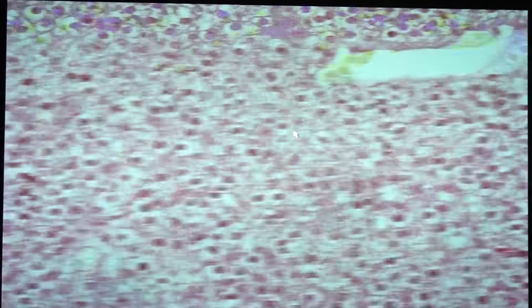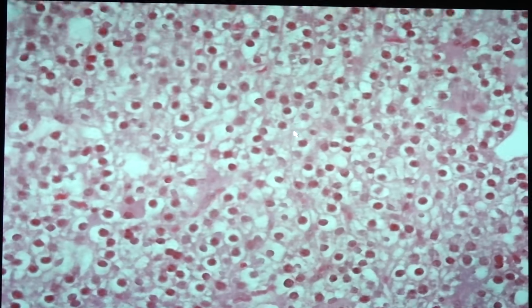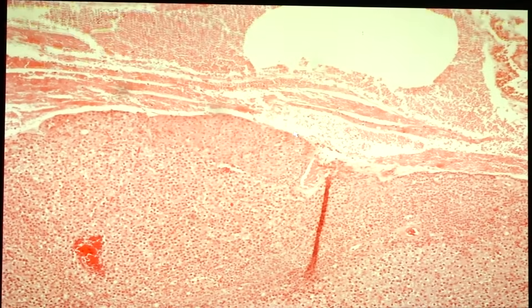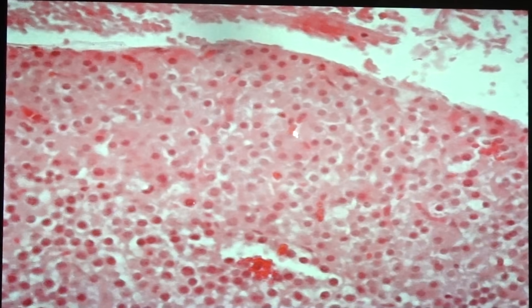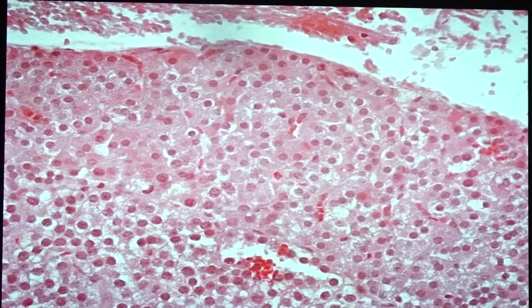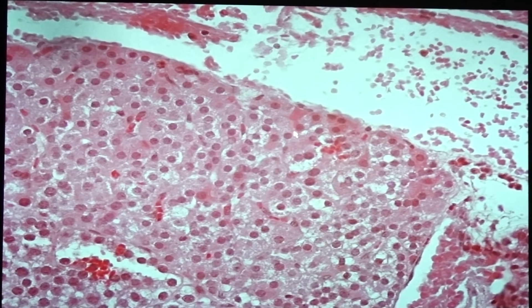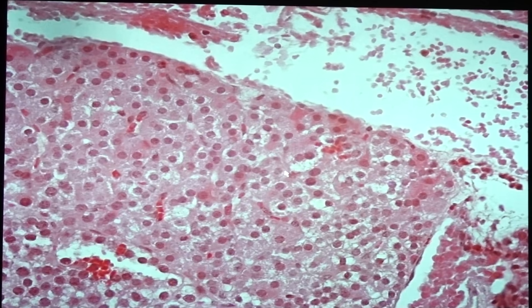Looking at the slide, you would see water clear cells that are monotonous in appearance. In some cases, you would also see the larger oxyphil cells, which possess pink, acidophilic cytoplasm. The oxyphil cells are larger than the chief cells and do not have a secretory function.